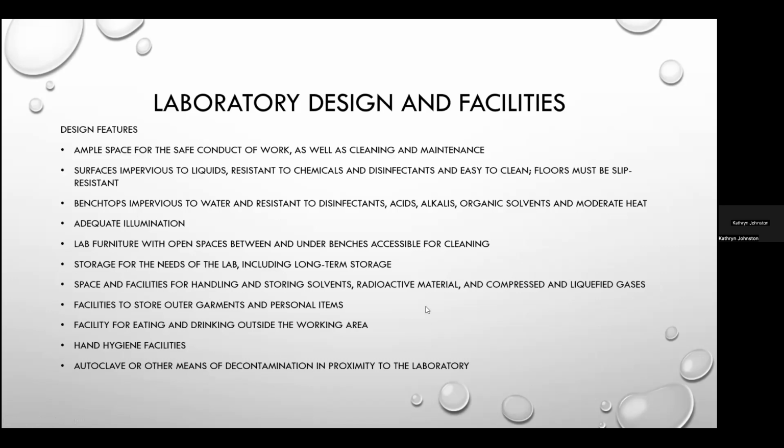So I'm going to briefly review the components of this that facilitate infection prevention. Obviously, ample space for the safe conduct of the work, but not only that, there has to be ample space so that you can clean the place. Your surfaces have to be impervious to liquids, resistant to chemicals and disinfectants, and easy to clean. Your floors need to be non-slip. Your bench tops have to be impervious to water and resistant to disinfectants, acids, alkalis, or organic solvents, and moderate heat. Obviously, you should have adequate illumination.